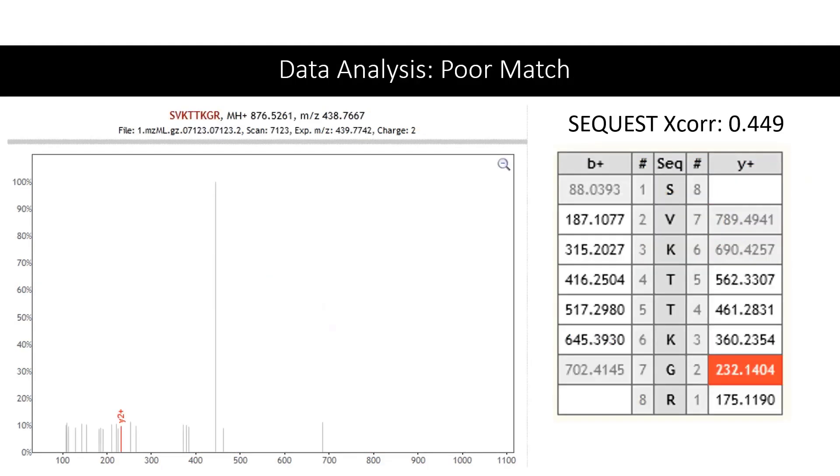On the other hand, this is an example of a poor match. The Sequest score for these spectra is 0.449, which tells us that it is unlikely that this experimental spectra corresponds to this peptide sequence.